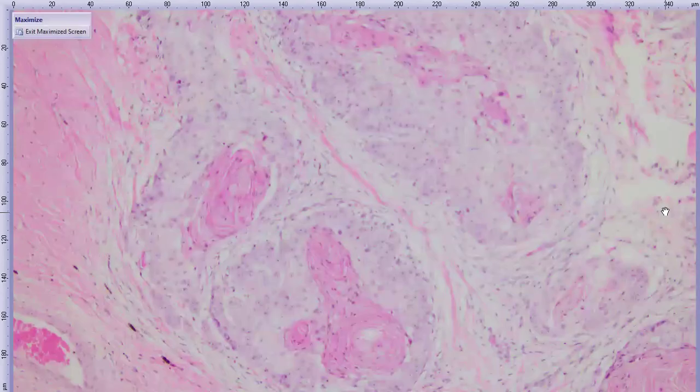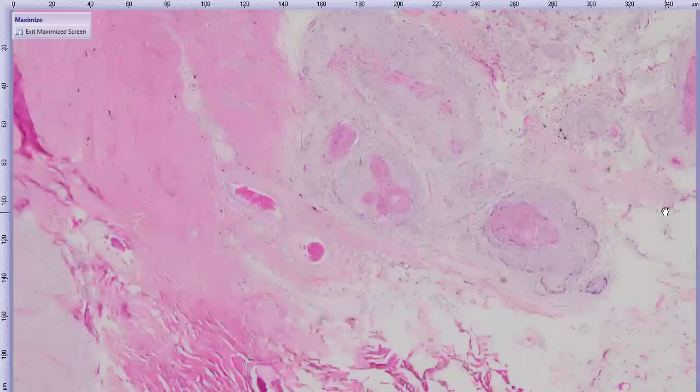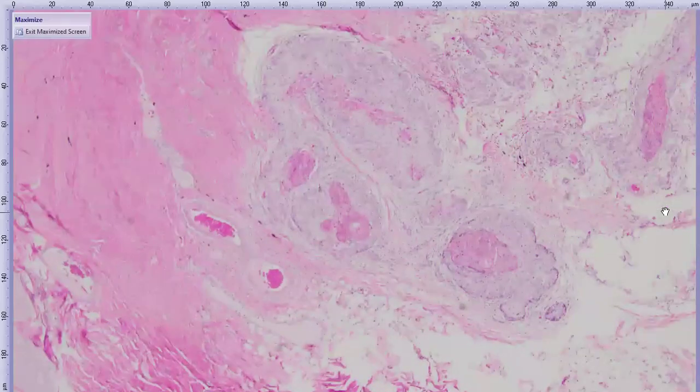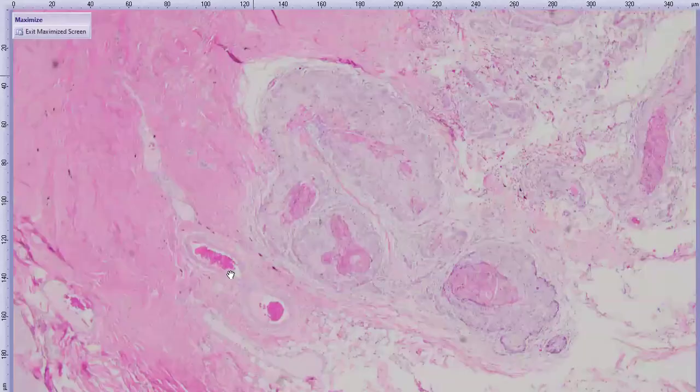I can show you the eyelids, and it was the same sort of thing. Why don't I do that? Go up, yeah, just up there one lower. It looks like you're treating the vasculature around the optic nerve here. Yes, there was suspicion for vascular invasion in this case. I can't remember if I ever found one that was super convincing, but there should be large vessels in there, and it's at the region of the short posterior ciliary artery branches, and the way it's sort of forming like a donut here.